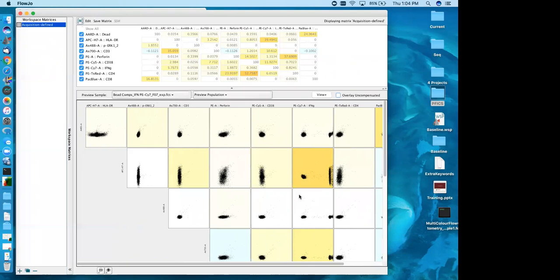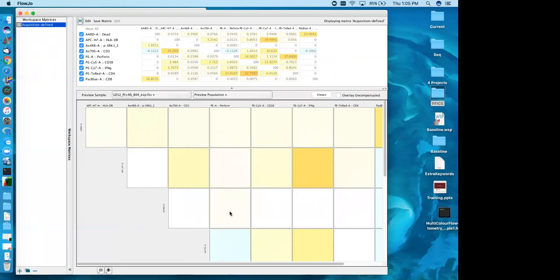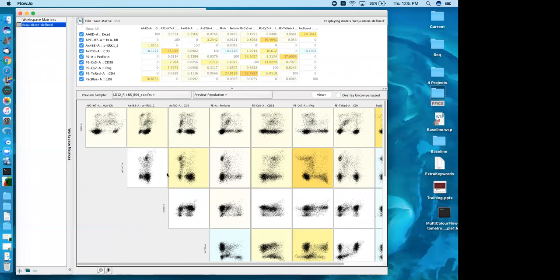And when I say perfect alignment, I mean the MFI, the median fluorescent intensity of background, should equal the median fluorescent intensity of single positives. So you should be able to draw a straight line to the middle of these two populations on every channel that isn't PE-Cy7, and have that line up. And then we can preview that on other samples to see that this looks like this is still the case, that we generally have sort of rectilinear data for when we expect there to be single positives within the population. All right, and so that's what you're looking for to assess how nice a compensation looks.